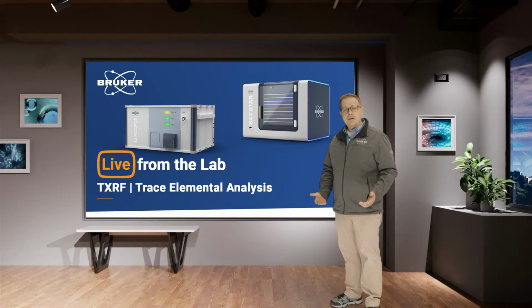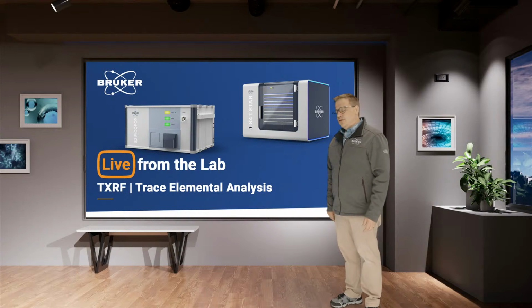This is the show where we talk about different technologies that Bruker's developed to help scientists discover the world around us. Today's topic is Total Reflection XRF. So this is something new. We haven't talked about it yet on the show, but it is related to XRF.